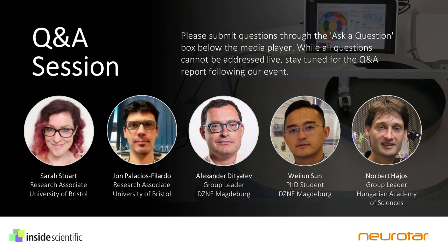Okay, great. Thanks, Sarah. And so we have a question here about juxtacellular electrodes. I'm going to direct this one to Norbert. What is the average time for recording with juxtacellular electrodes in head-fixed behaving mice?